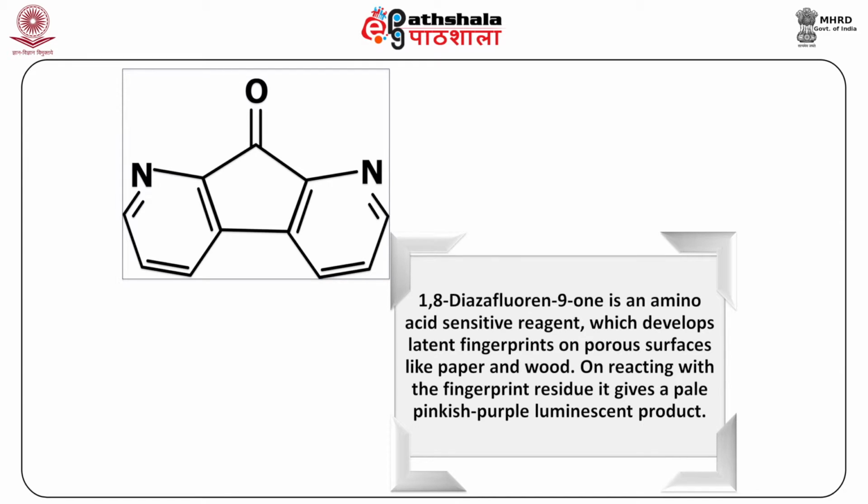1,8-diazafluorene-9-one, DFO, is an amino acid sensitive reagent which develops latent fingerprints on porous surfaces like paper and wood. On reacting with the fingerprint residue, it gives a pale pinkish purple luminescent product. The structure of 1,8-diazafluorene-9-one is depicted in the given figure.